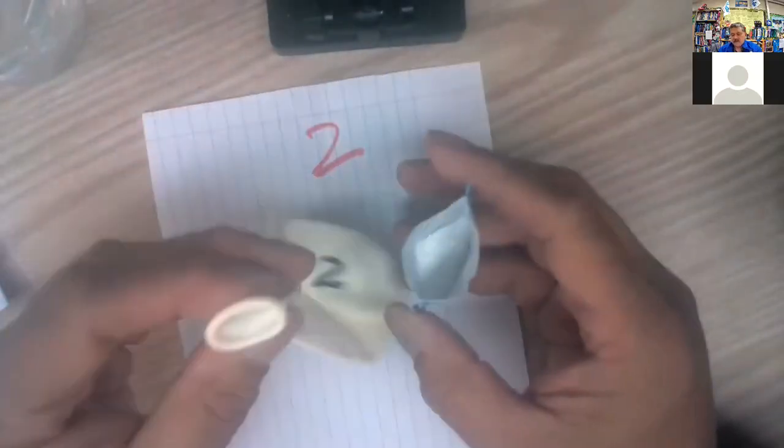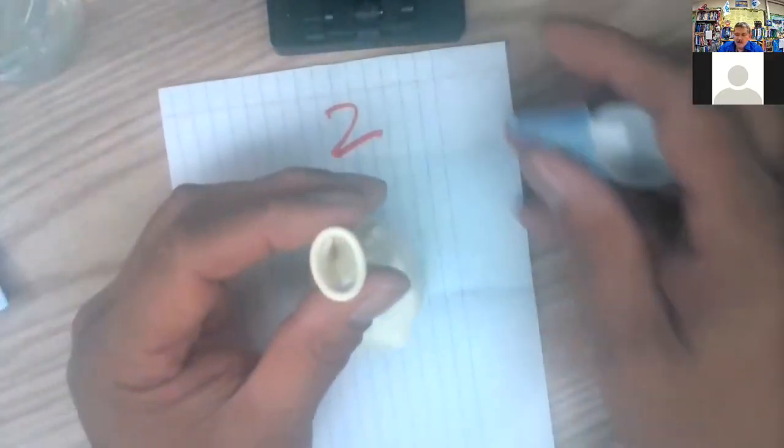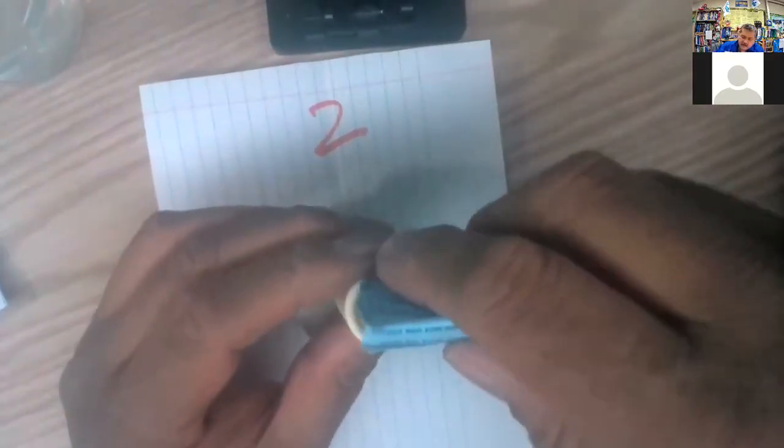And just like I did on the first one, I'm gonna put some air in there to blow that up a little bit, make it a little more round and make it easier for us to pour the powder in. Here we go. Starts it up a little bit. Now I got a hole to work with. So let's pour that stuff in.